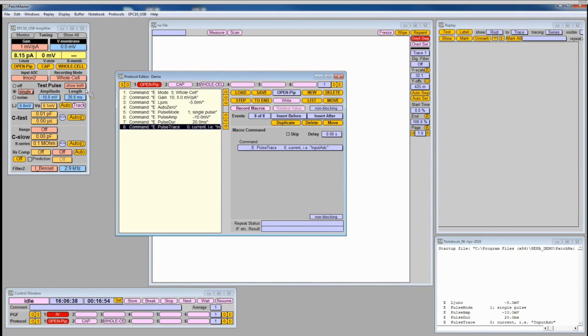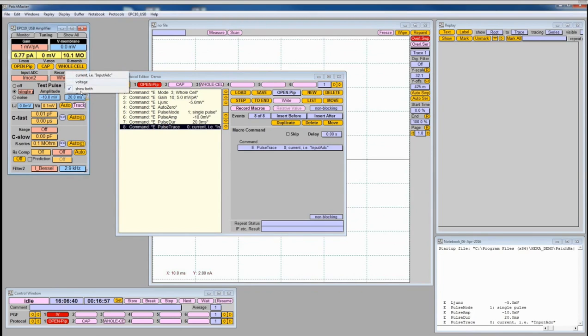And to show you that it will do this later automatically, I reset it now manually to the former settings that it had, so that you will see that it will be done automatically when we do the actual automation. Okay, so this is all set back to where it was before.